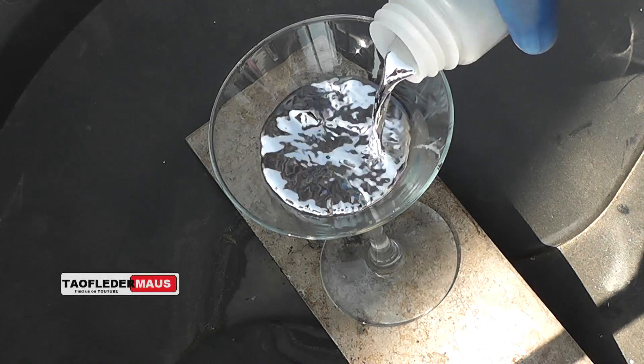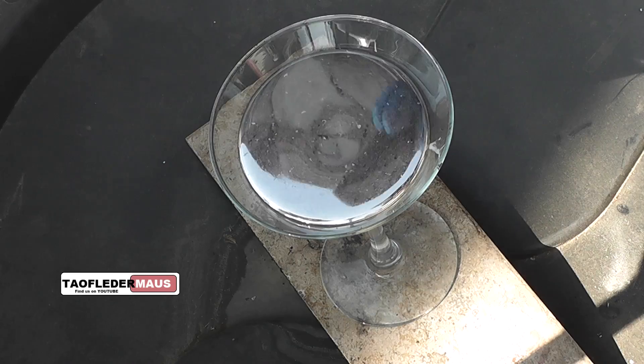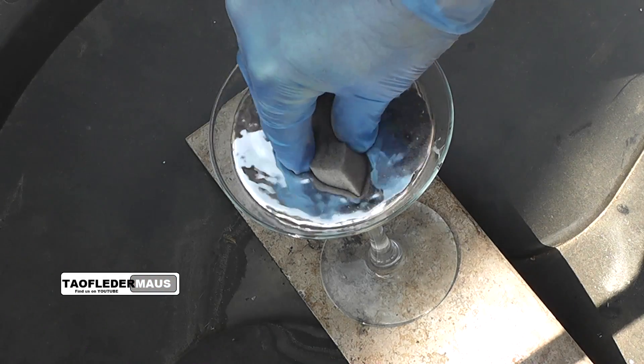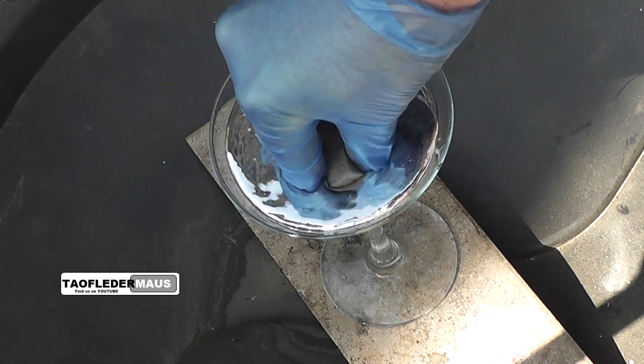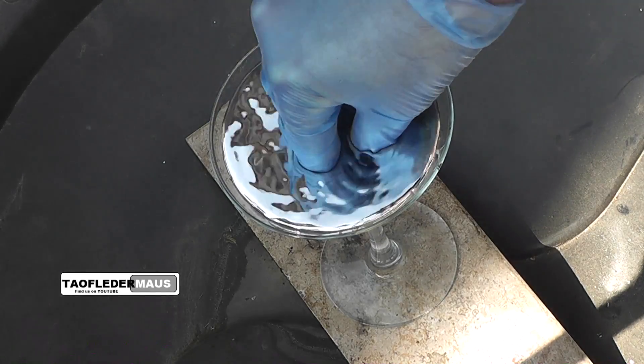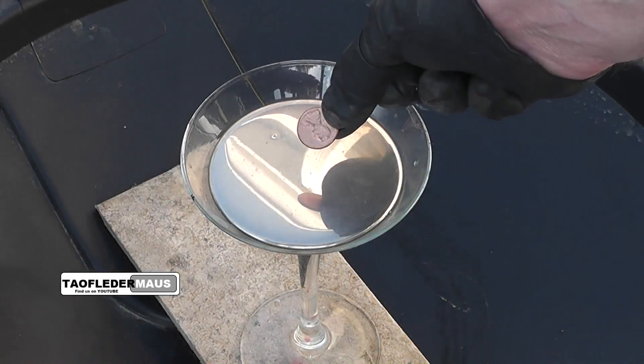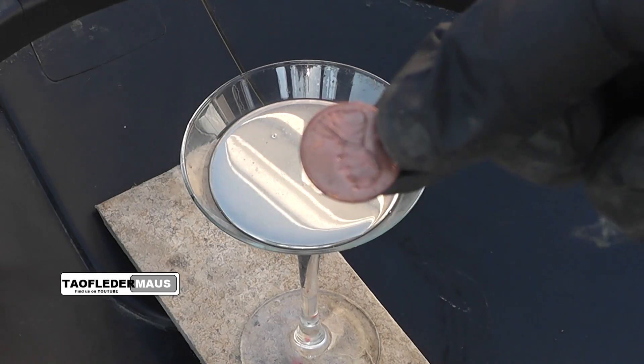Hello everyone, this is Jeff of Tauflary Mouse. We know that you cannot soak up mercury with a sponge. Mercury is a liquid metal and it just doesn't have the wetting properties to be absorbed by that sponge or any sponge for that matter. So rather than a sponge, we'll try to soak it up today with a penny.